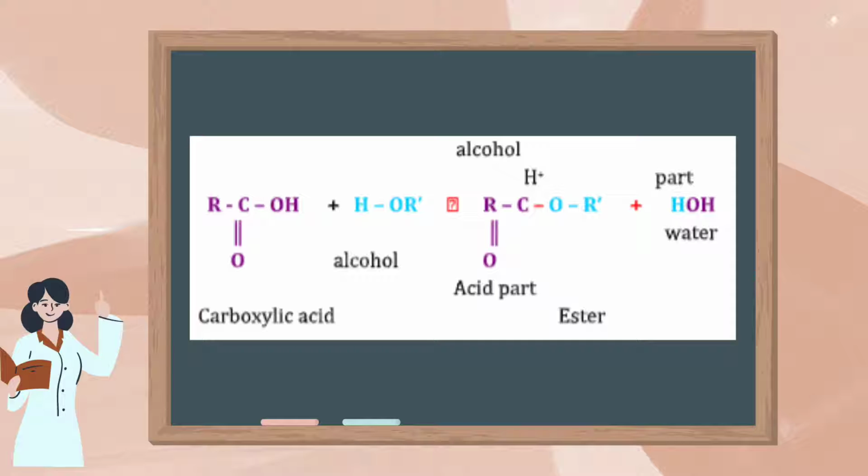Example. The formation of ester is usually detected by the evolution of a pleasant odor. Carboxylic acids are relatively resistant to oxidation. However, some acids like hydroxy acids and other multifunctional acids may be oxidized.